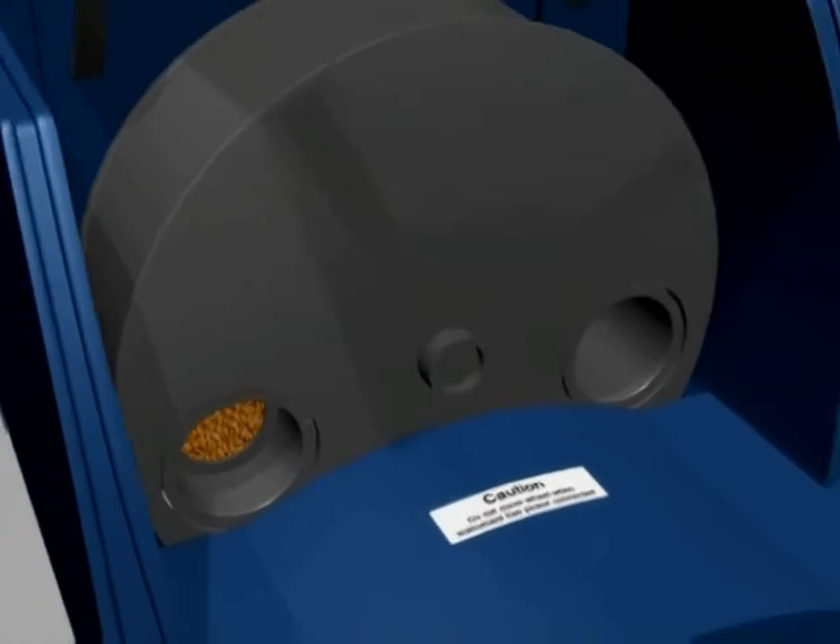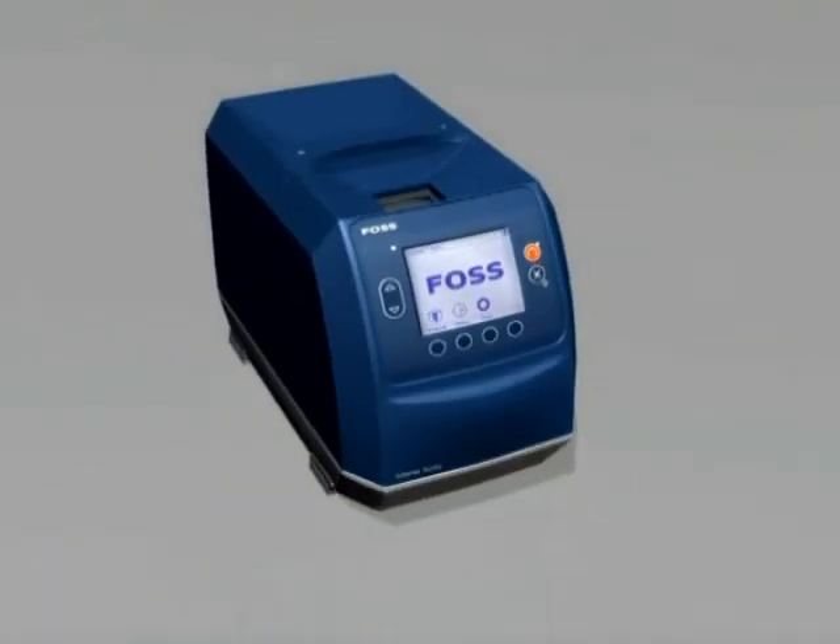Close the hood and drawer, then reconnect the power supply and wait for the instrument to complete the start-up test. Once the start-up test has been successfully completed, you are ready to analyse more samples.